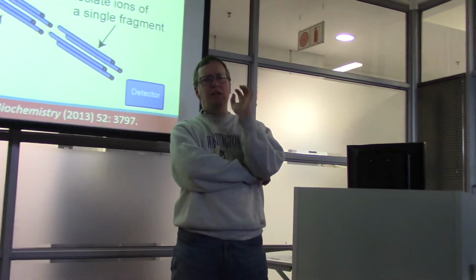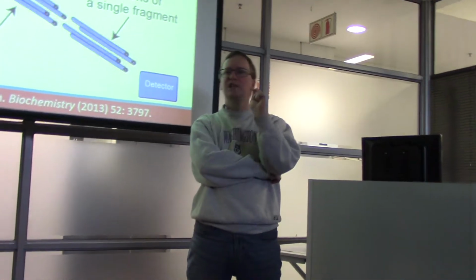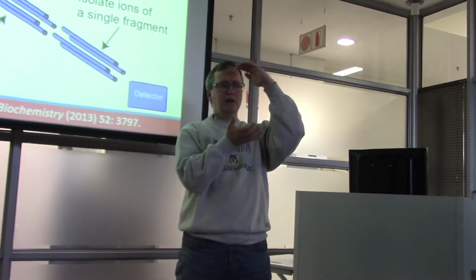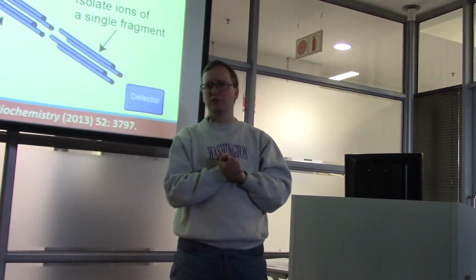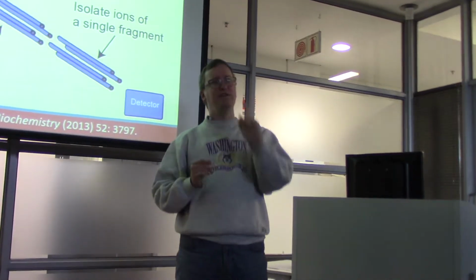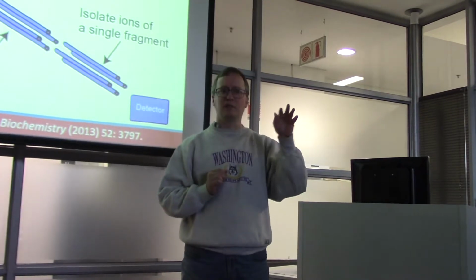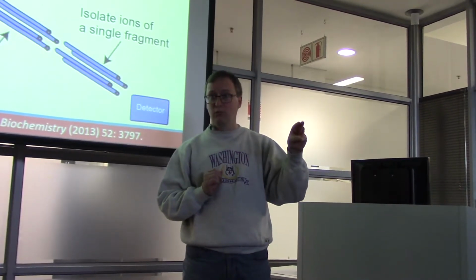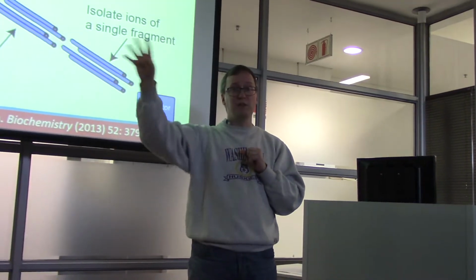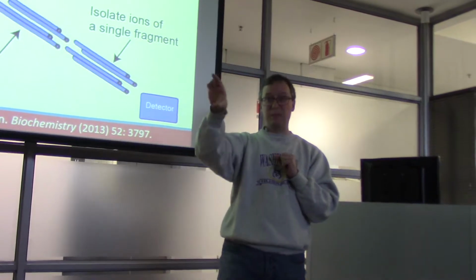So I'm going to give you a quick hypothetical. Imagine that you think these 50 proteins, here's my list, these 50 proteins are likely to be differential between my cohorts. So you've got some hypothesis you're starting with. These 50 proteins are known to produce these 3 peptides each when I analyze them in tandem mass spectrometry. Okay, so we started with 50 proteins of interest, and we've now turned that into 150 peptides of interest.